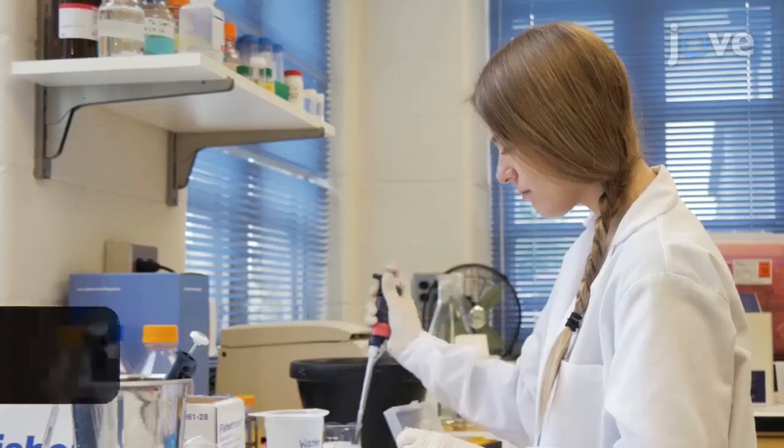Demonstrating the procedure will be Carly Fabian, a student research assistant from my laboratory.